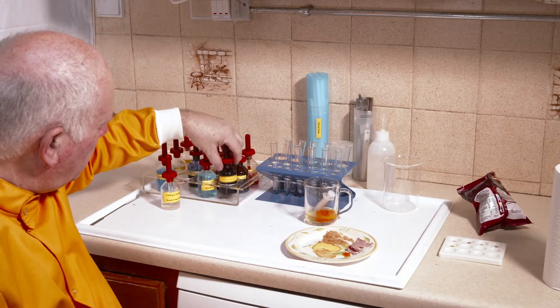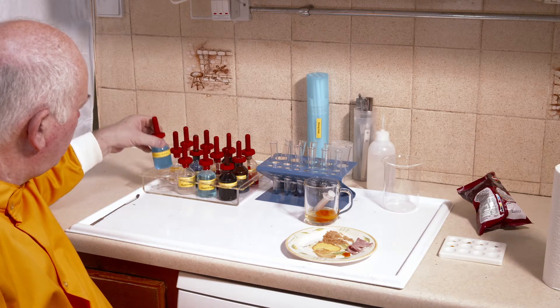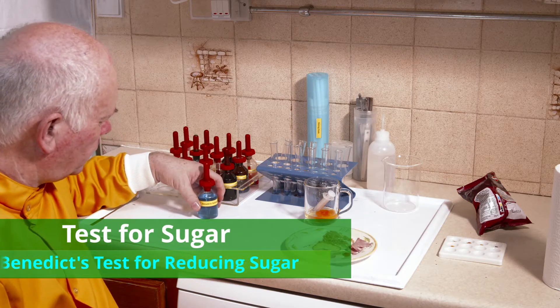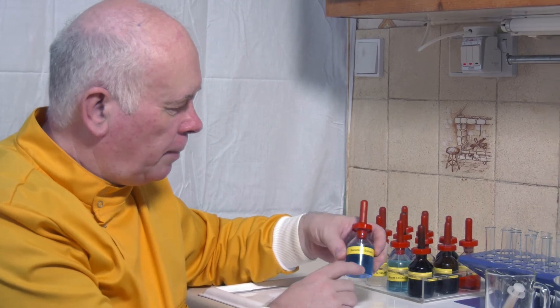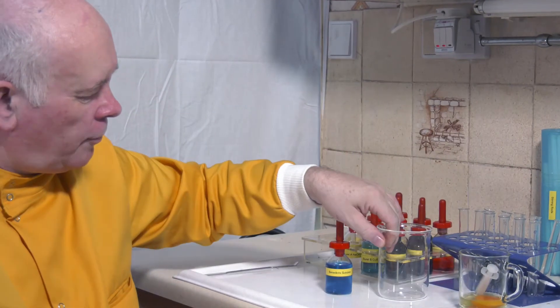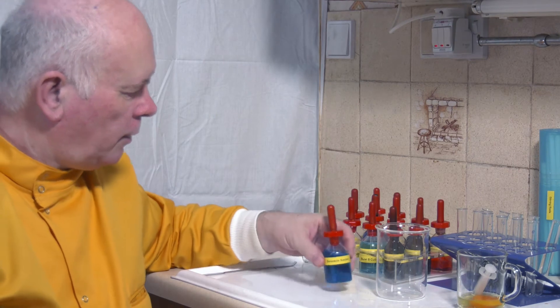So we've done iodine and we've done the test for protein. How about the test for a sugar? For sugar we're going to test with Benedict's solution, and it's a two-part test. The first part is we're going to add the Benedict's solution to these different samples, and then we're going to put them into a water bath — here a beaker — and I'll put some hot water in to see what's going on.